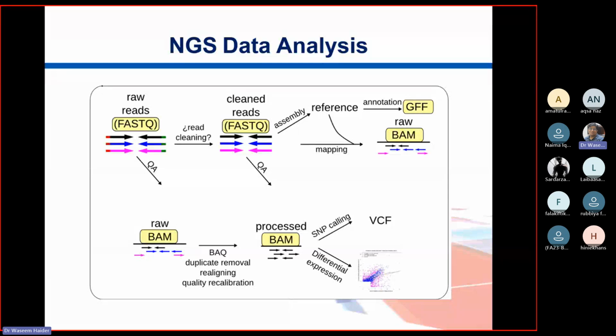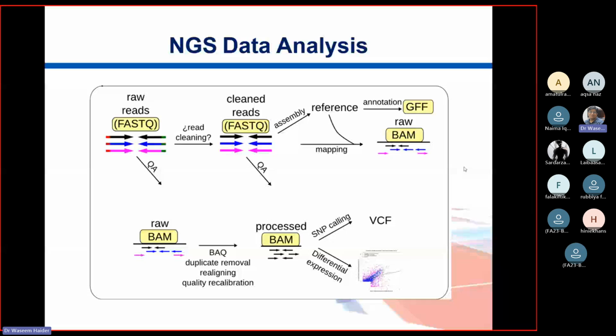And then from scaffolds you go to chromosome level, and then in the end all chromosomes are put together with orphan contigs or scaffolds, the additional assembled materials which are not fitting into any of those 24 human chromosomes or whatever species this is. They are the extra pieces of the chromosomes or accessory regions. They are just put there, right?